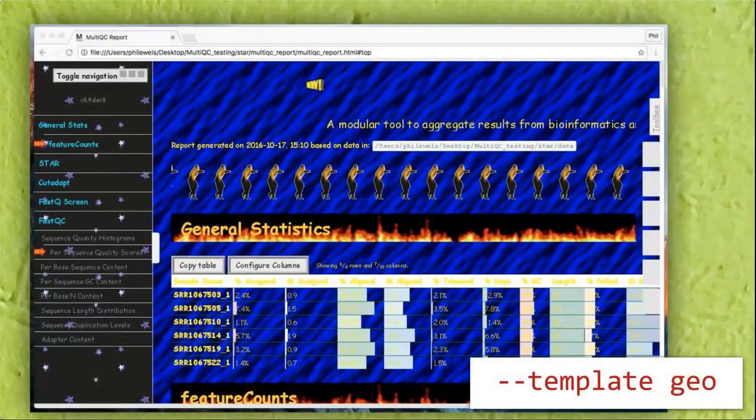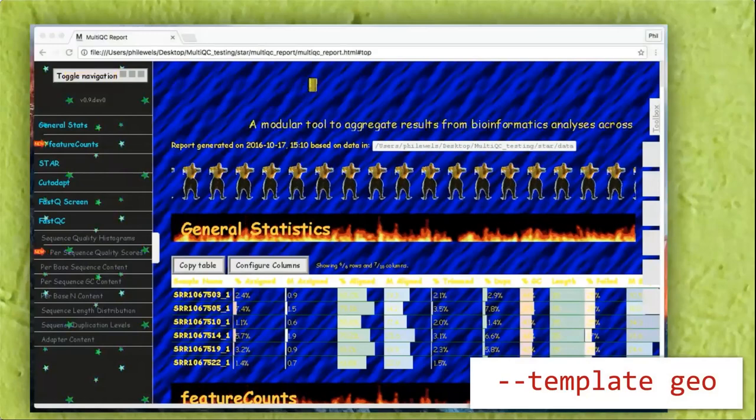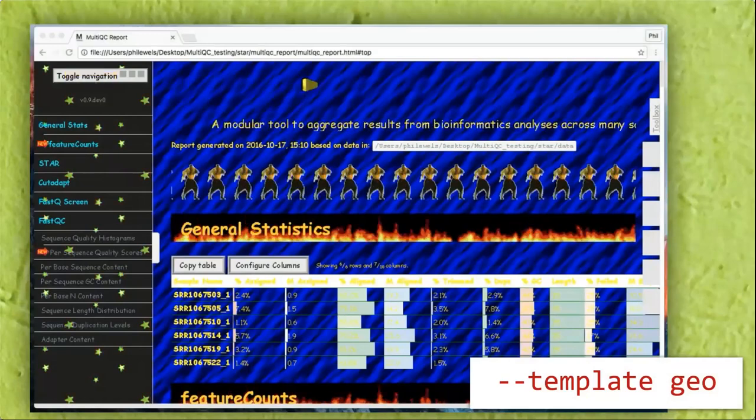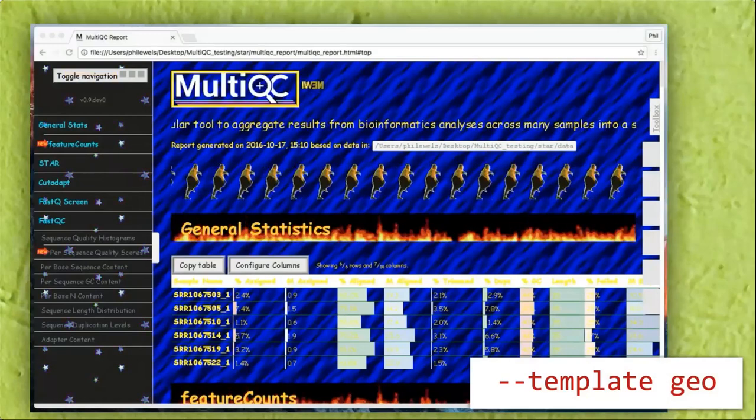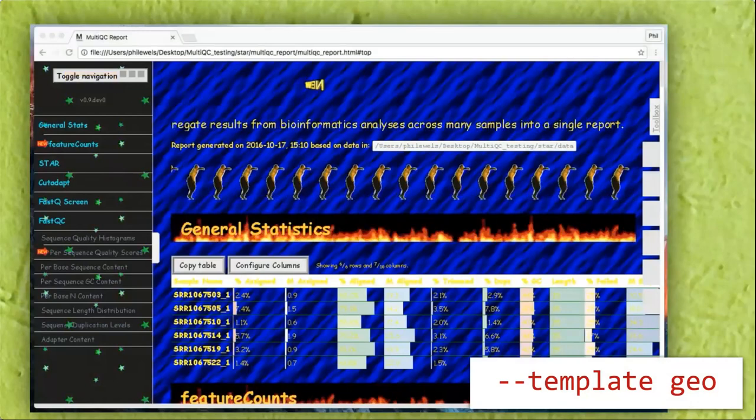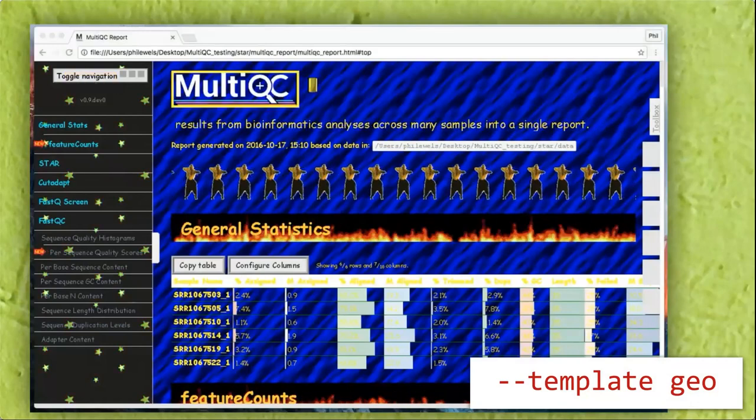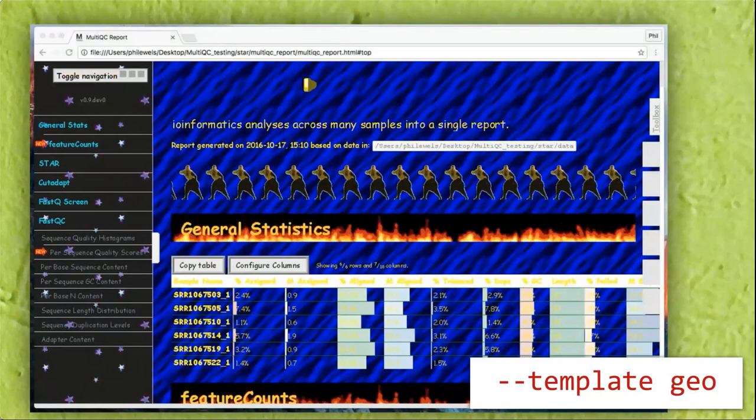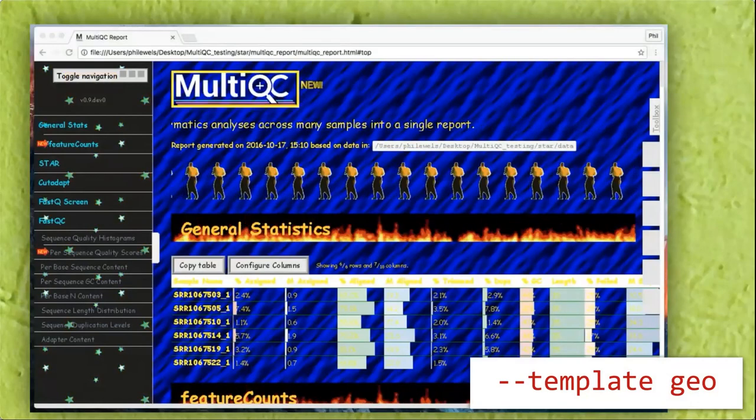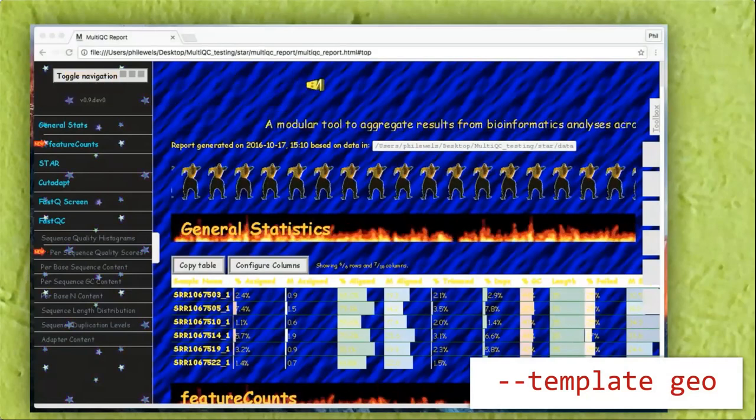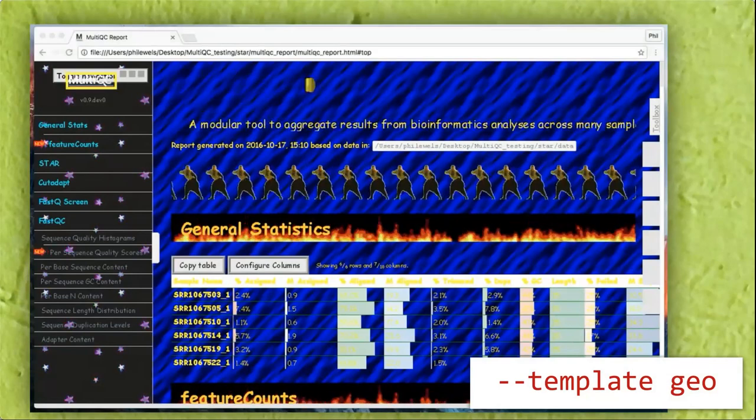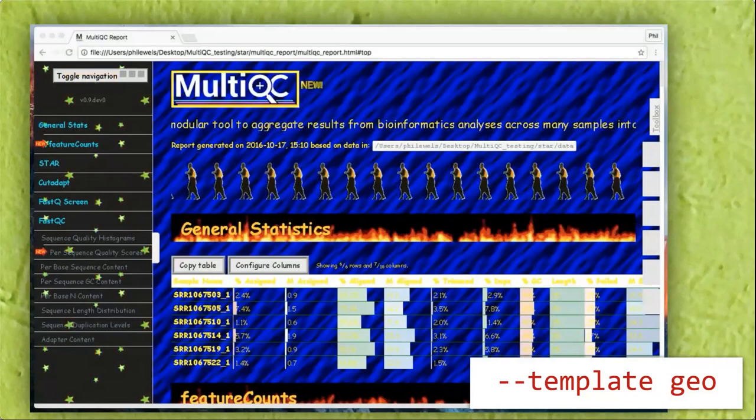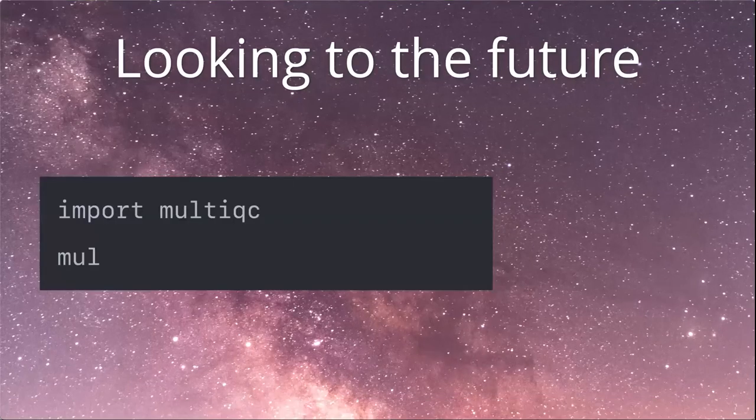And then, of course, if you really want to, this is an example of going to town with customizing your report output, just to give you a flavor for what's possible if you really go for it. This is a little Easter egg in MultiQC, so see if you can figure that out with --template.